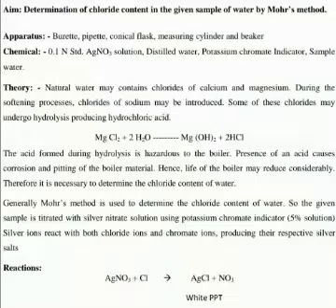Hello students, today we are understanding the virtual experiment: determination of chloride content of a given water sample by using Mohr's method. Apparatus for this experiment are burette, pipette, conical flask, measuring cylinder and beaker.